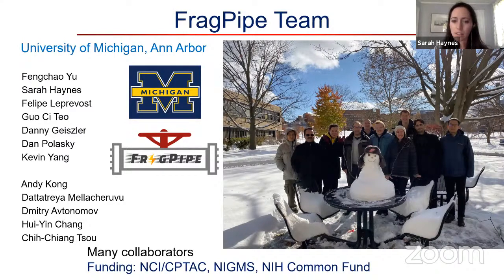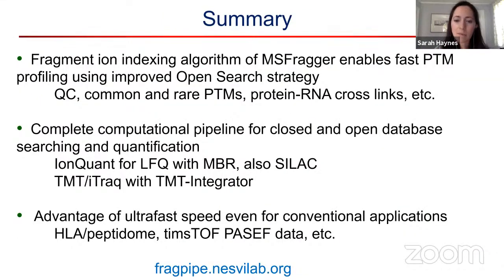So let's see, one question is about search sensitivity between closed and open search. They ask, how do you explain that some proteins have more identified peptides in closed searching versus open searching, based on one of the figures that was in the slides?